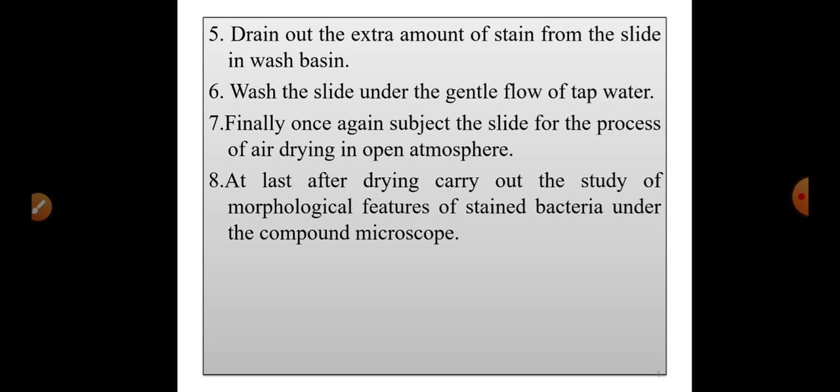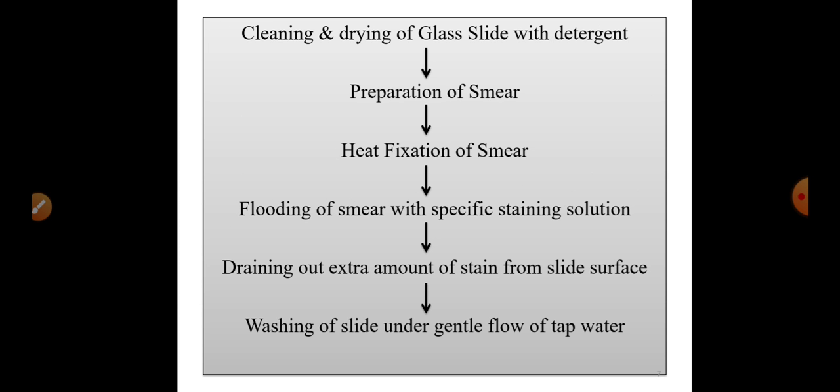After washing, once again subject the slide to air drying in the open atmosphere. Finally, after drying, carry out the study of the morphological features of the stained bacteria under the compound microscope. The bacteria are now heat-fixed on the glass slide and can be observed under the microscope.